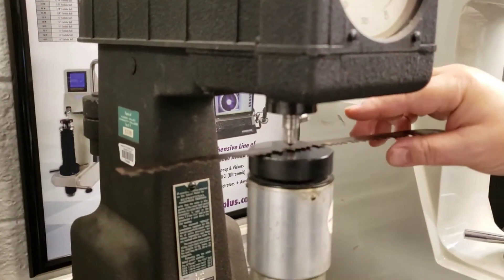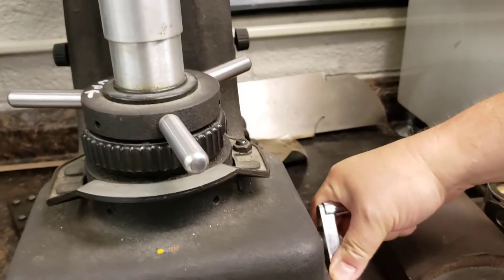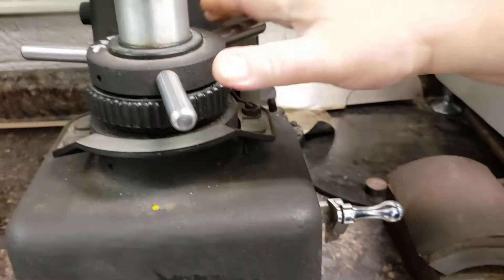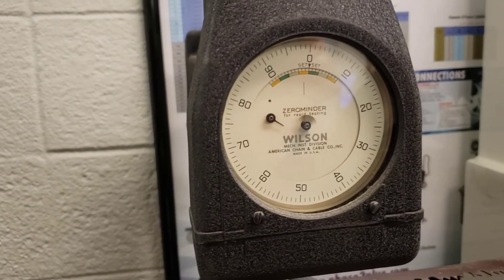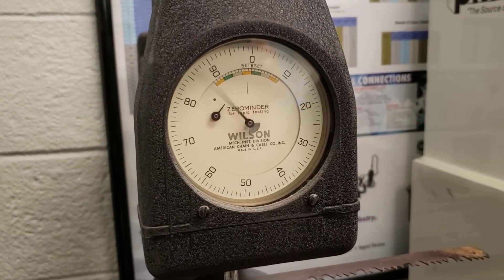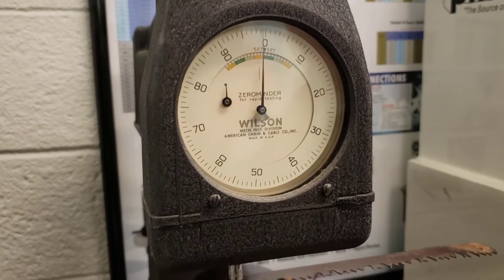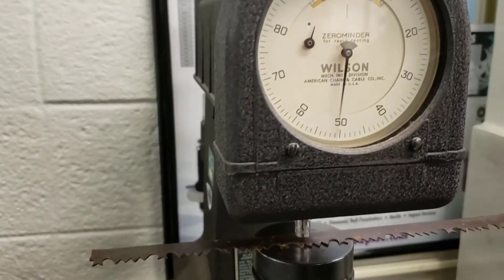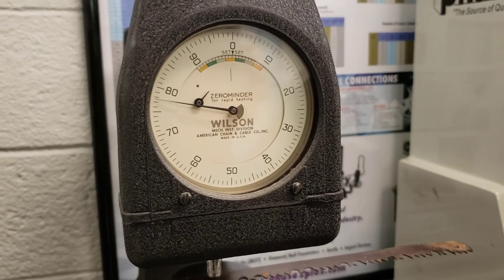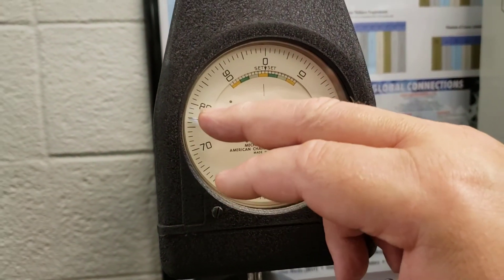We'll put the blade in. Remember how we do these — set the trigger for the preload, set the little arrow into the dot. Adjust the large dial to zero using the dial. It's all zeroed out. Hit the bar, and we have the full load on. This is N-45, and we can see we are N-45-78.